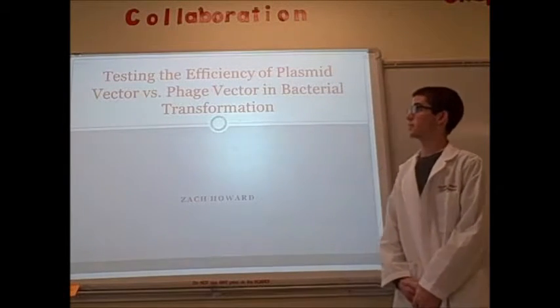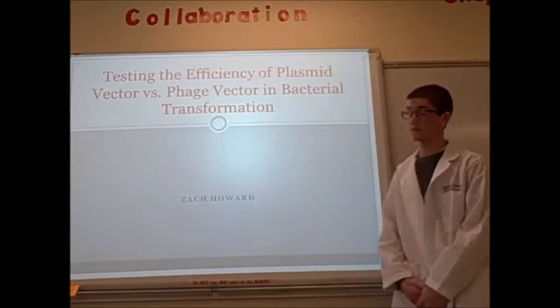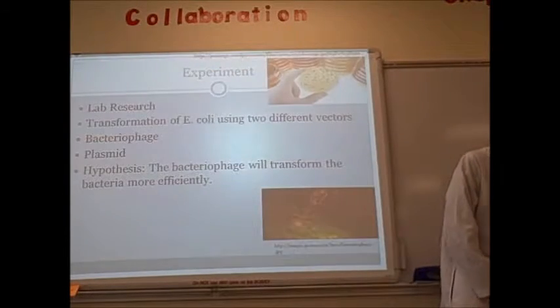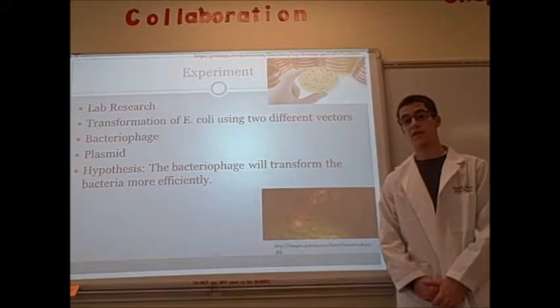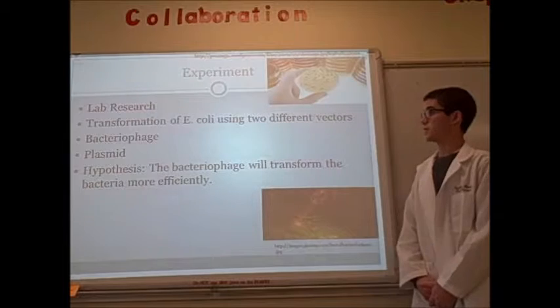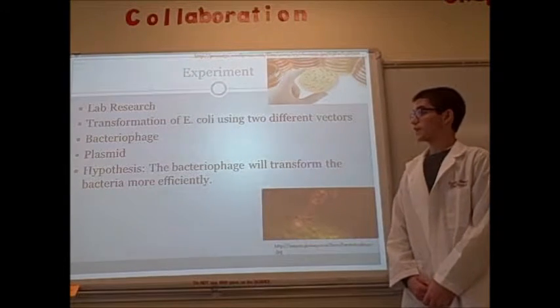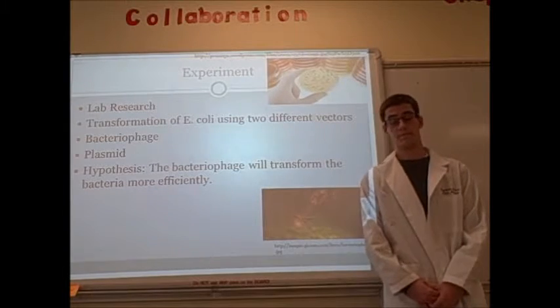For my Biotech Expo project, I was testing the efficiency of plasmid vector versus phage vector in transformation of bacteria. For my project, I did lab research. I was testing the transformation efficiency of E. coli using two different vectors. These two vectors were the bacteriophage and the plasmid.